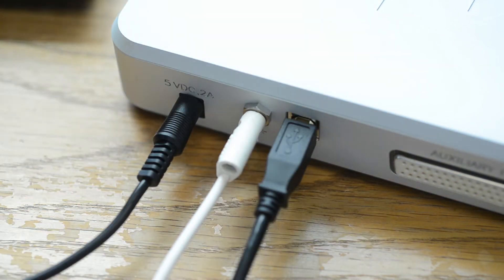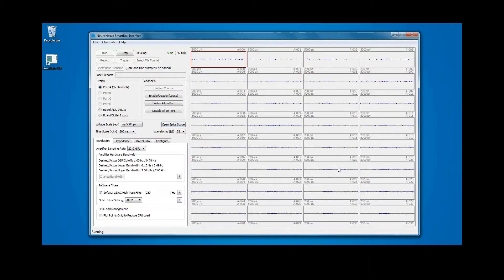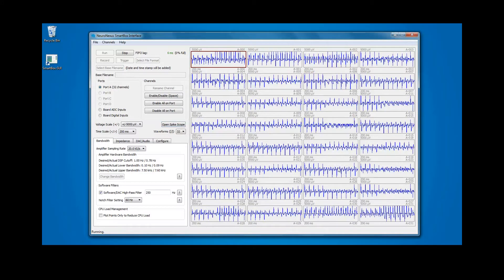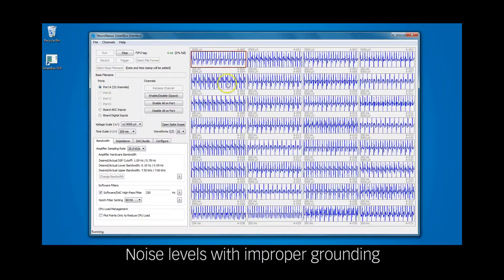The ground cable needs to be connected to earth ground for effective recording. Some socket ground connections may not be grounded correctly, so it is recommended that you verify a correct earth ground connection with an outlet tester or an electrician. Without a proper ground connection, noise may be introduced into recordings.